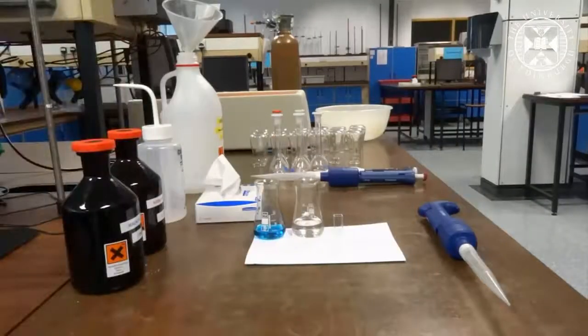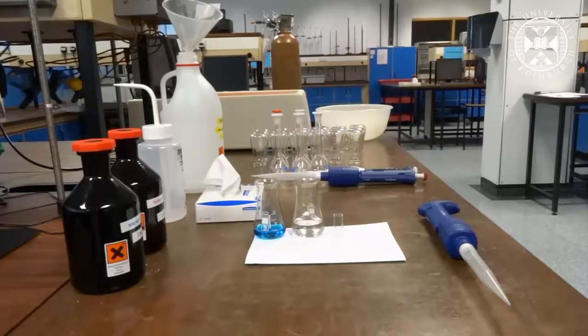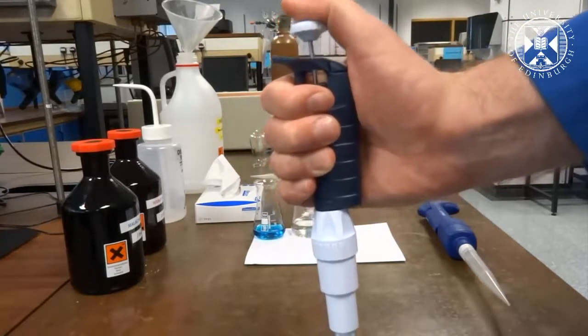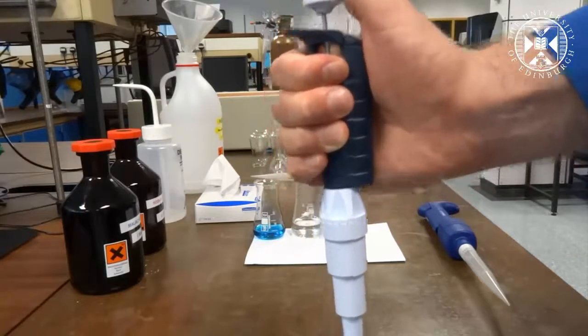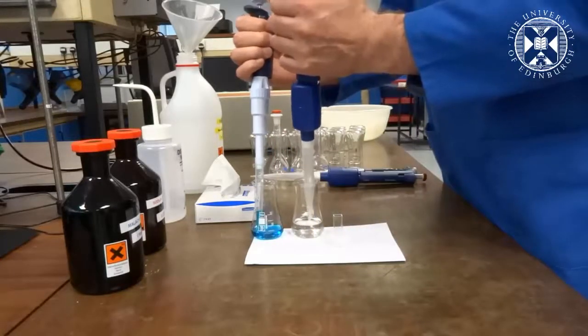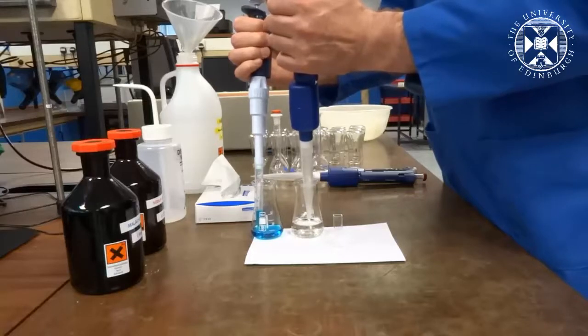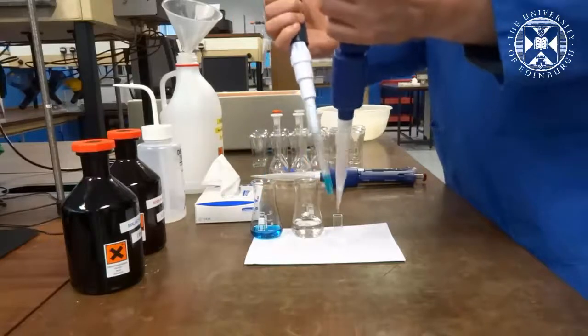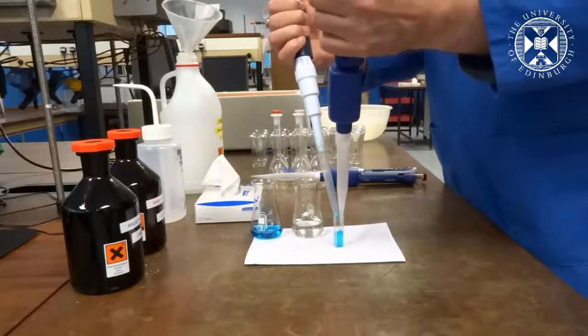To study the reaction we will add equal volumes of malachite green and hydroxide. This is easily achieved using pipettes. Remember with these pipettes that to draw in the liquid you push down to the point of first resistance. To eject you push firmly down all the way. Mix in the two reagents at the same time to ensure good mixing.